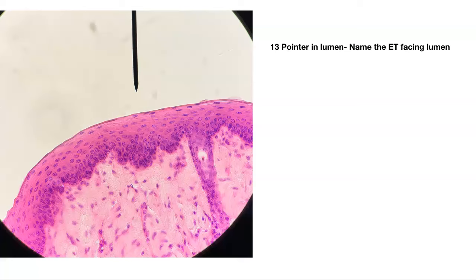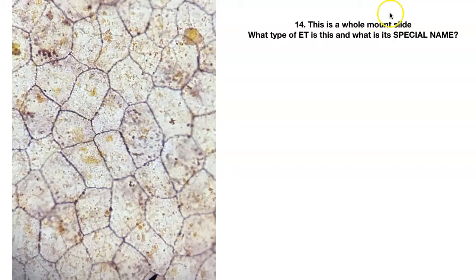Number fourteen — here's that whole-mount slide again. What type of epithelial tissue is this and what's its special name? The type is simple squamous — you're looking down at this plate of cells, here's the cell border. What's its special name? Mesothelium.